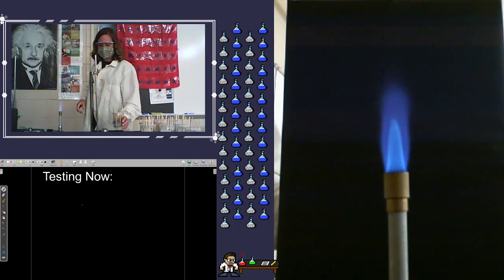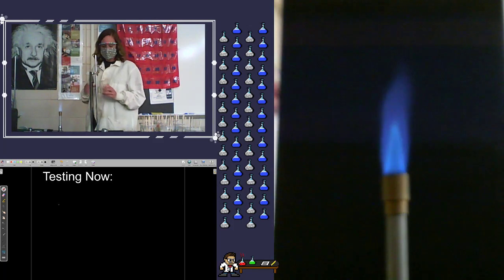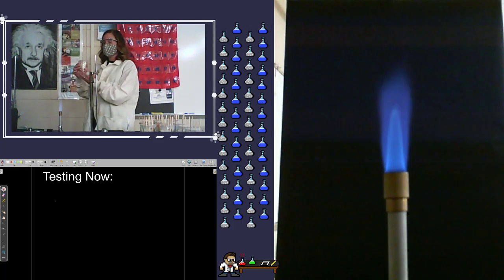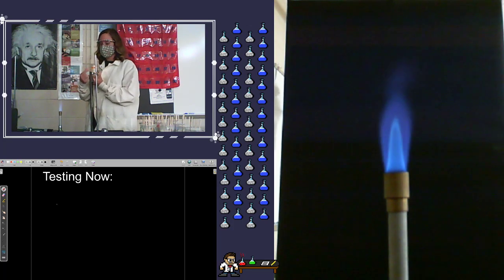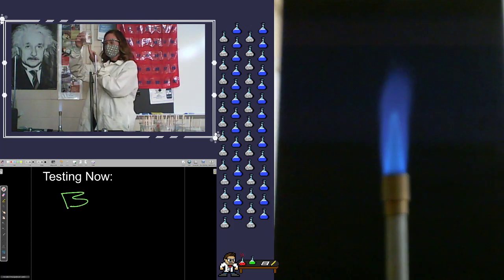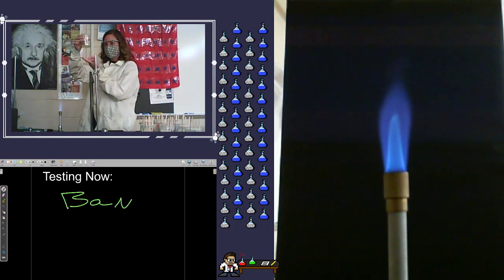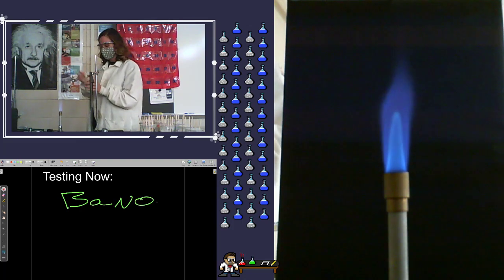So let's go ahead, Ms. Laschiva, just tell me which ones you're starting with. The first sample we're looking at is barium nitrate. If you look at the liquid, notice it's a clear colorless liquid when I dissolve it in solution.